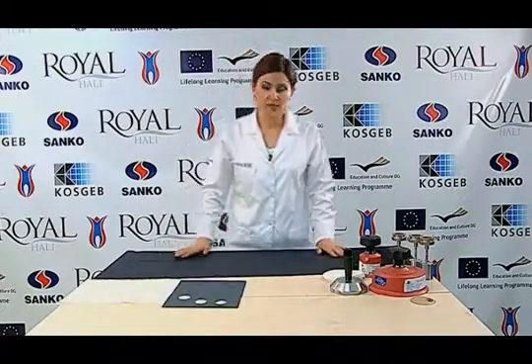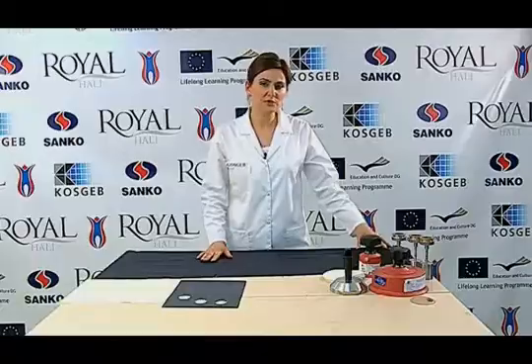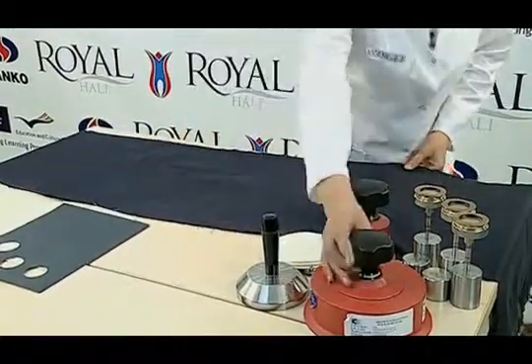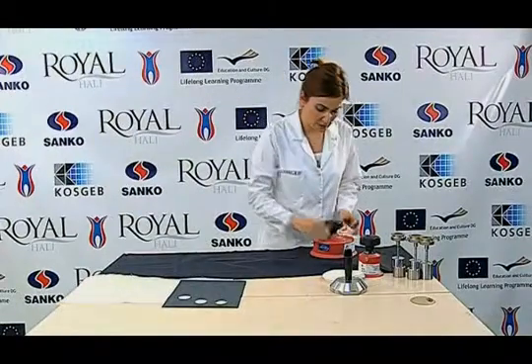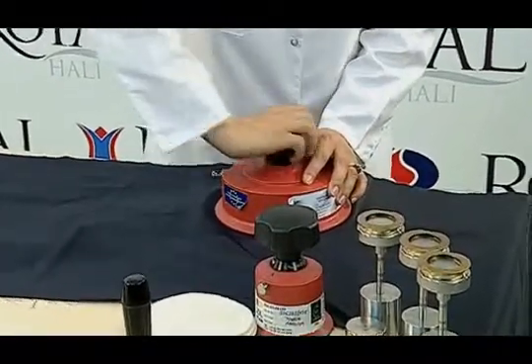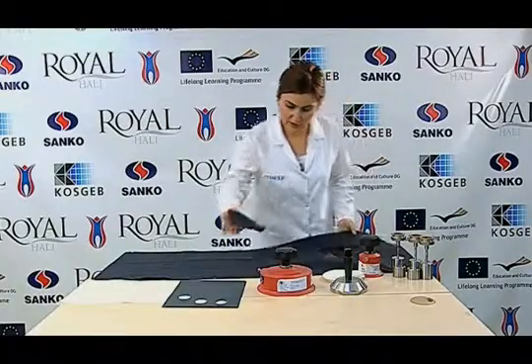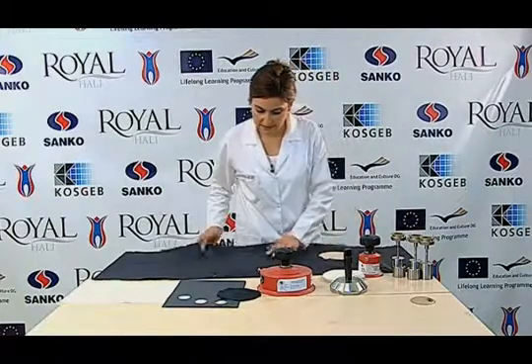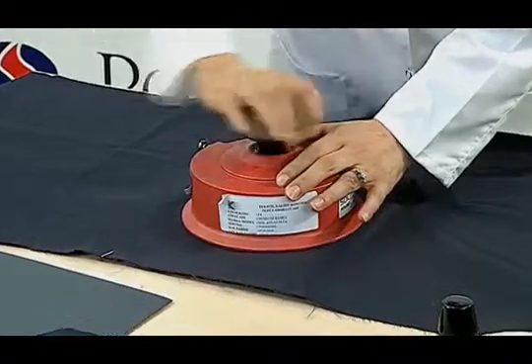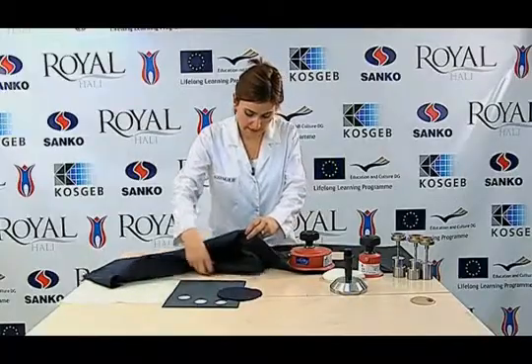Before the test sample is cut, it is spread on a flat surface and conditioned. Four samples with a diameter of 140mm are cut from 100mm inside the selvage of the conditioned specimen. Samples are randomly cut from different parts of the specimen so as to represent the specimen. It must be made sure that the sample is not tight when cut.